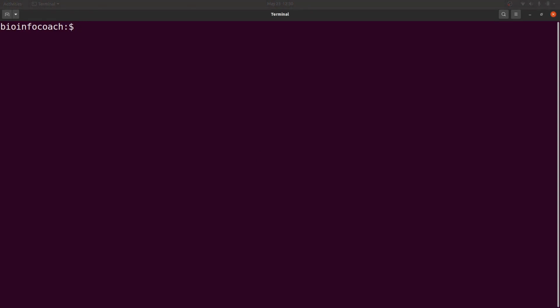Okay, so we are on the terminal now. On the terminal, I assume that you have installed Mamba or Micromamba, but I'll use Mamba, by the way. We will need to first create an environment and install BUSCO in it.